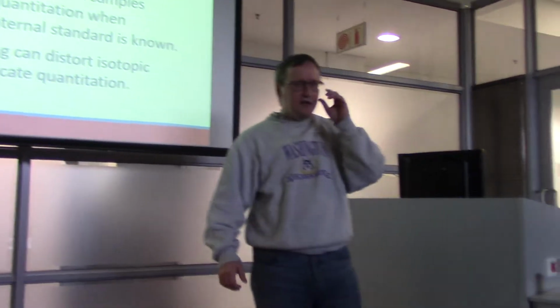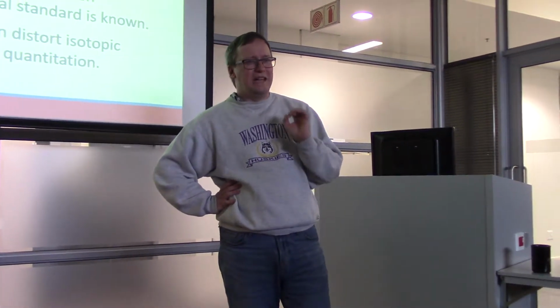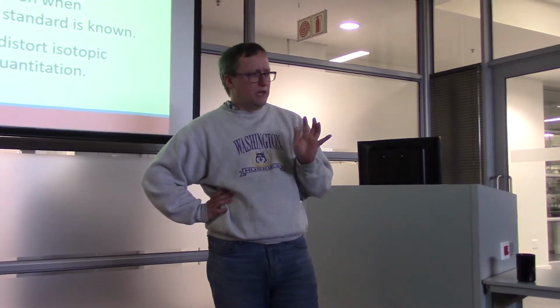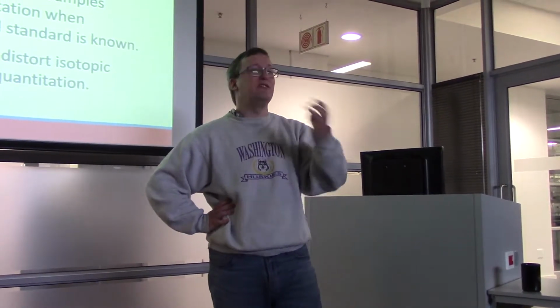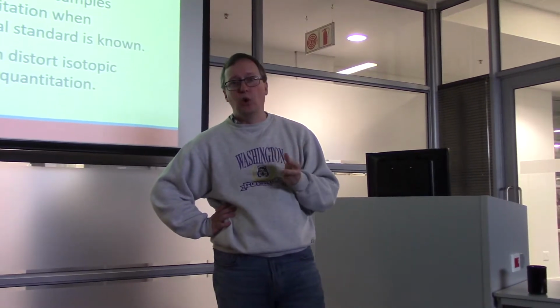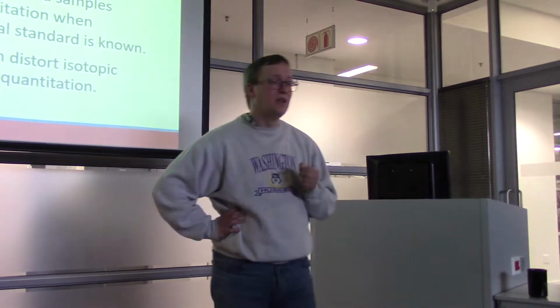So now that we've talked about chromatograms, it's time for us to talk about labeling. So most generally, you will find three different elements that are used to introduce a heavy mass into something: C, N, and O, okay? So C is carbon, N is nitrogen, O is oxygen.